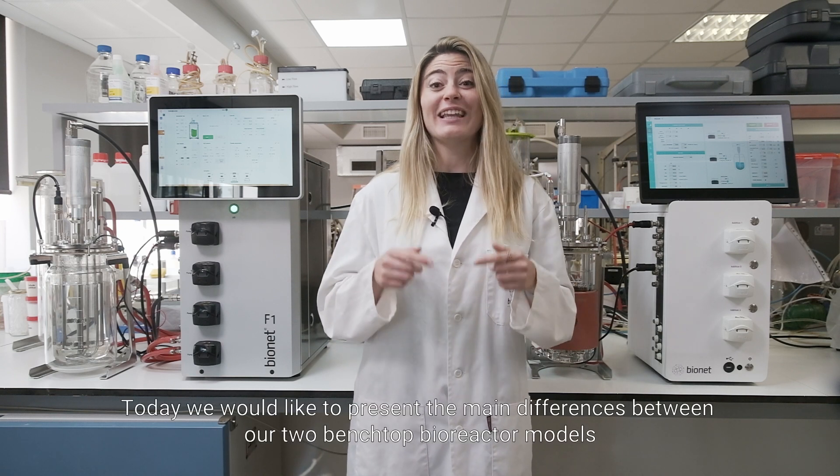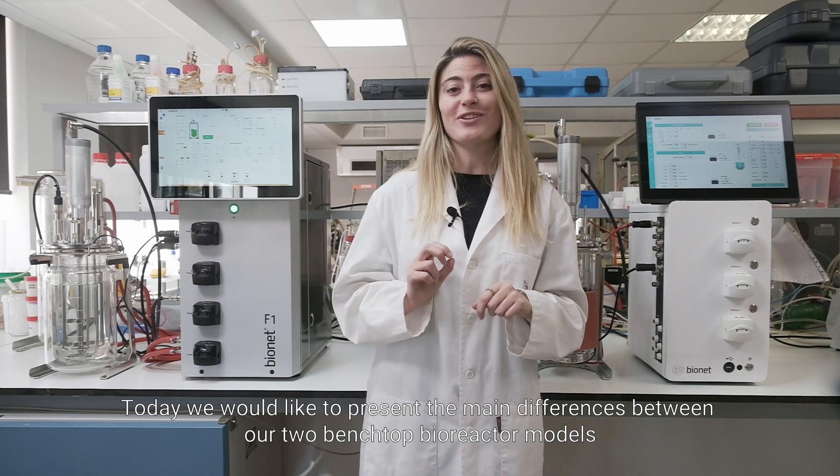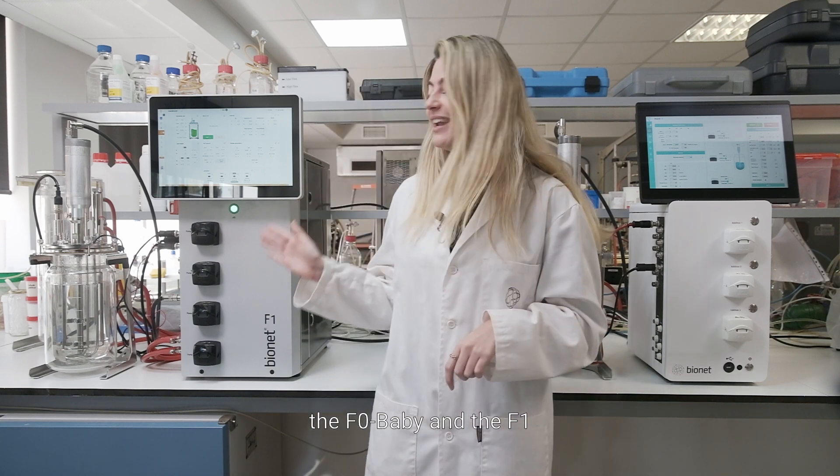Welcome to Take a Look. My name is Elena Perez-Pena and I am the Scientific Marketing Coordinator at Bionet. Today we would like to present the main differences between our two benchtop bioreactor models, the F0 Baby and the F1.